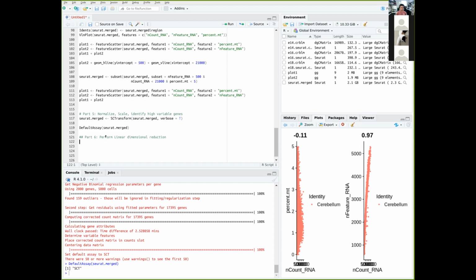There are several ways to do this. The most straightforward way, theoretically easier to explain, is the PCA plot, and it's a very common plot in a lot of publications. You also have the t-SNE plot, which is a stochastic way of modeling this reduction, and you have UMAP, which is currently one of the standards for single-cell RNA-seq, because it gives you better results. I'm not going to give you a lot of details about this.